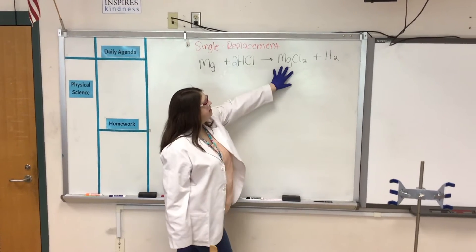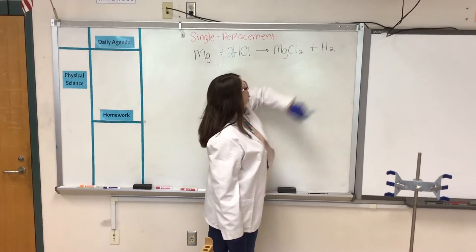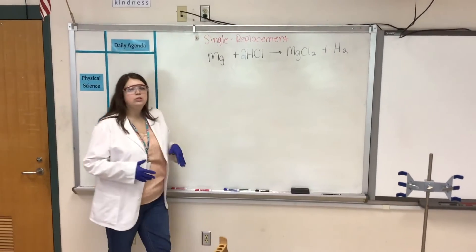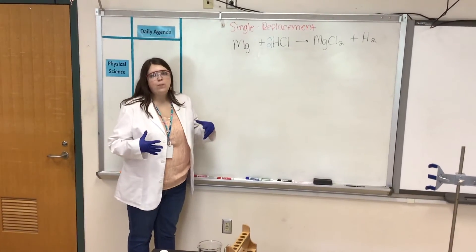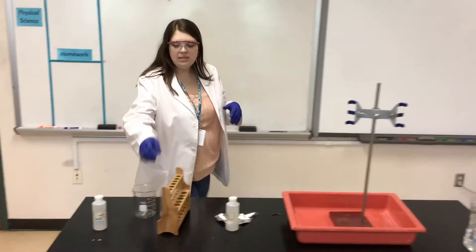This is going to make magnesium chloride, and hydrogen got pushed out. Essentially magnesium and hydrogen switched places, and a single replacement reaction occurred. Let's see this in action.